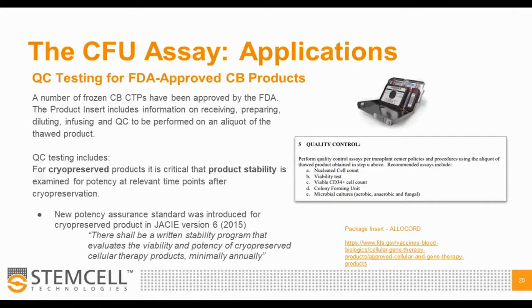They want to confirm that, if they've shipped it to you, typically in cryo shippers, and the temperature monitor says it's okay, that is probably a good indication that the product you have in your hands is good. But assuming that you don't thaw it inappropriately and that it's thawed well, this assay can then really tell you at the end what the product that the patient got was, and what the stability and potency of that product was.